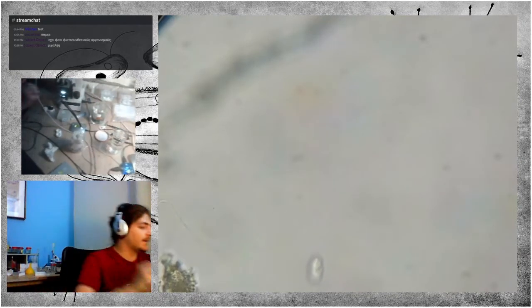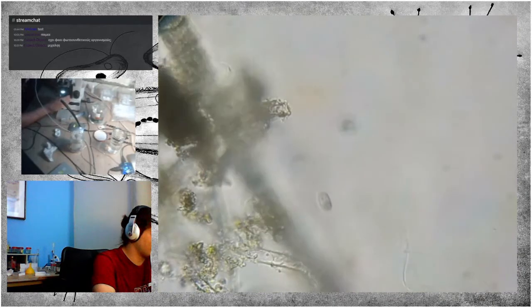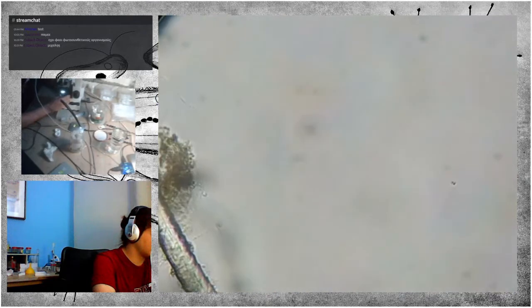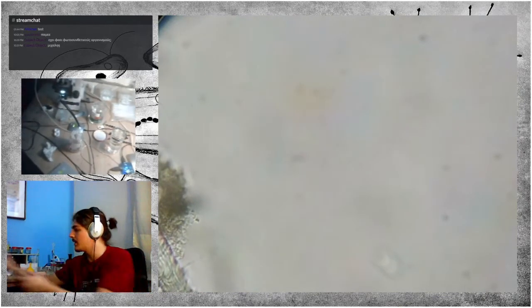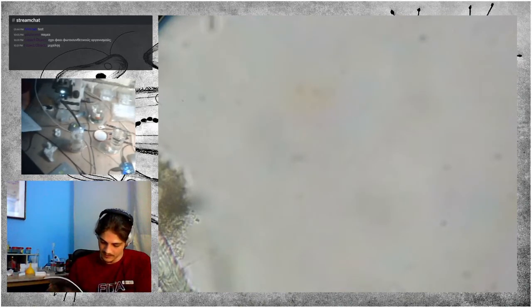Shame. This organism, the ciliate, seems to have very long cilia, and I think I have an example of a similar one in the identification book. Also, there were some amoeba above that I'm going to look at next, but let me check.